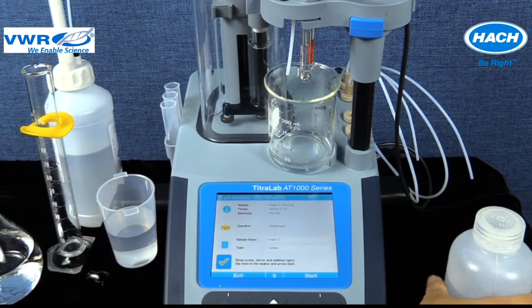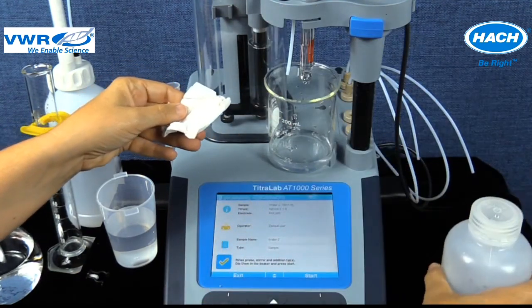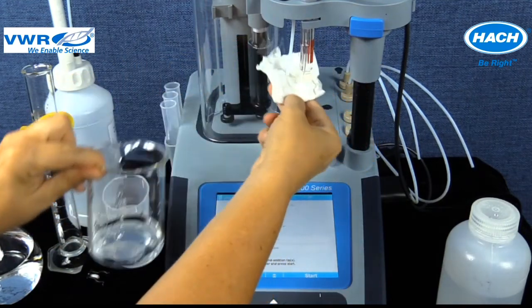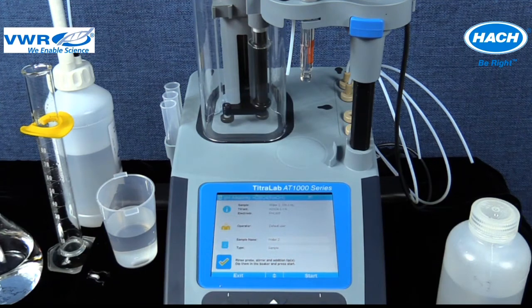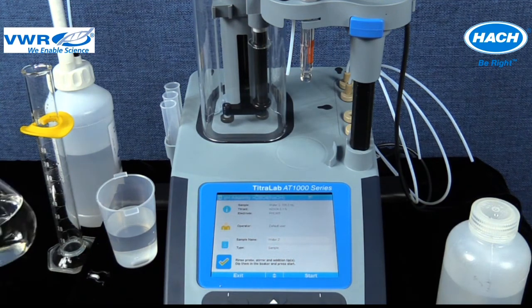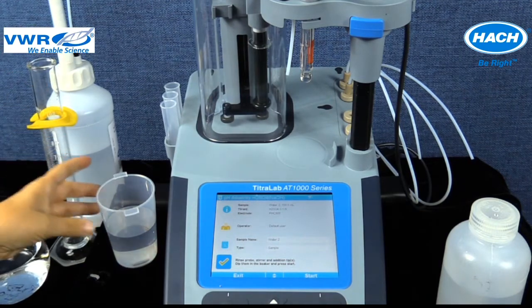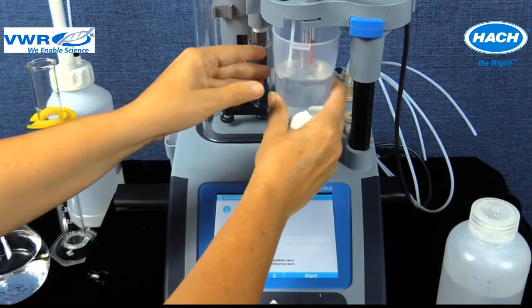Before the titration can be started, there are three steps that need to be performed. Step 1. Rinse the electrode and tubing tips with deionized water into a waste container and blot the electrode dry using a clean wipe. Step number 2. Accurately measure out 100 ml of sample using a graduated cylinder into a sample beaker. For other applications, the amount may be different.